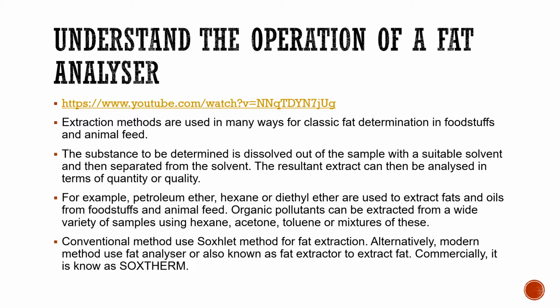Then after the solvent extraction, we separate the sample from the solvent, so the resultant extract can be analyzed in terms of quantity or quality. Quantity means you know the amount, the value, the percentage, the composition of the sample, while quality is how to determine and identify the sample.